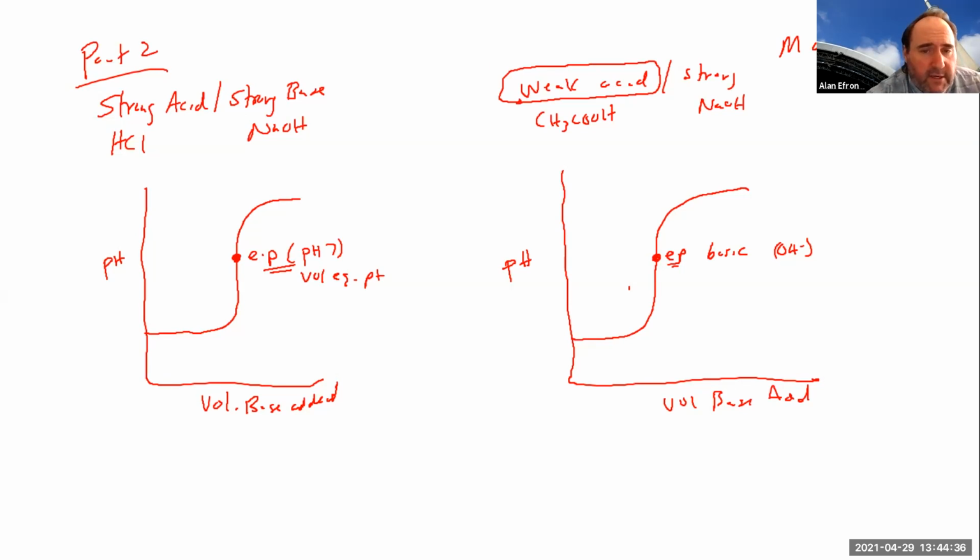And we're going to also try to figure out a couple of things. We're going to try to figure out what is the pKa value and our, because I don't remember off the top of my head, Ka value. So either the Ka value or the pKa value from the titration curve.